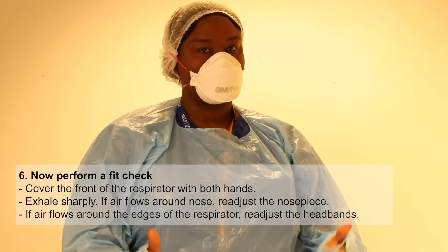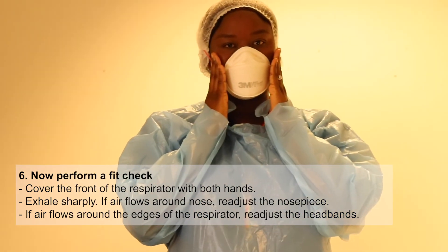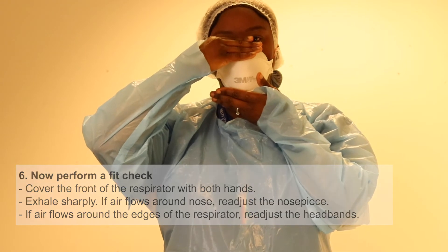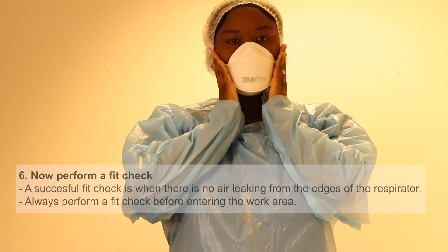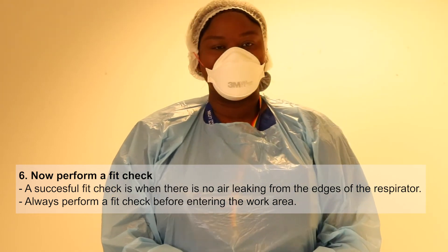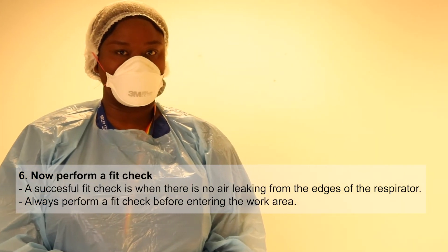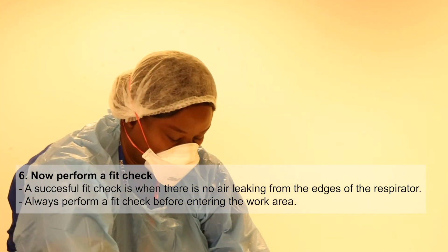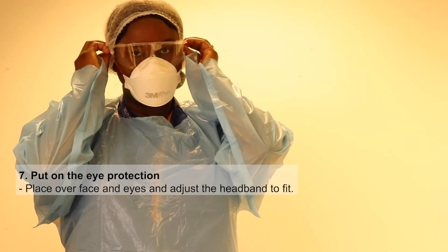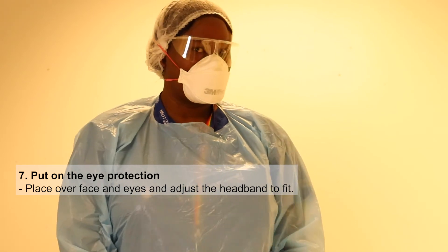This is the most important bit — you do a fit check. Put your hands each side and blow, checking at the top as well. Feel for any air coming out. That's the check you have to do every time. When you're happy with that, put your eye protection on, and then the final thing is to put your gloves on.